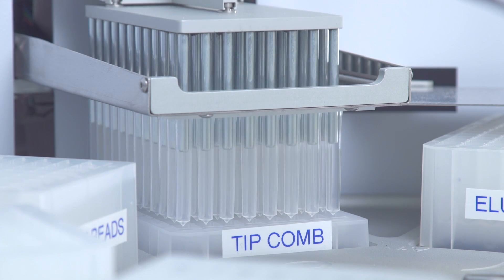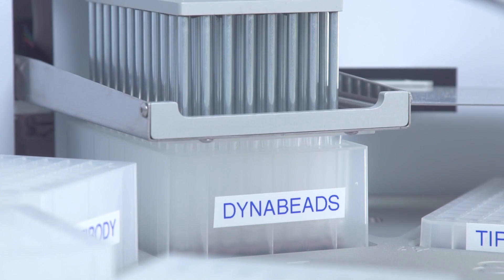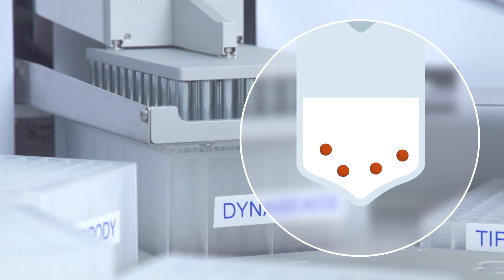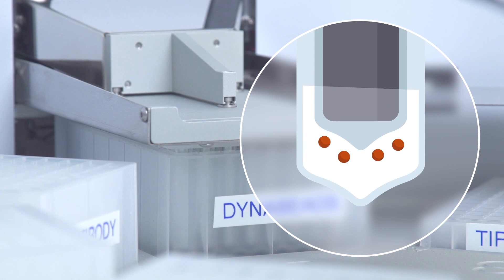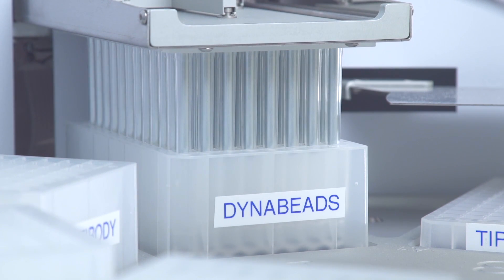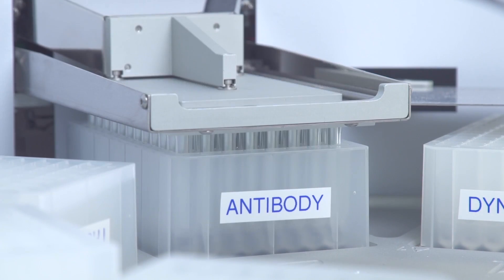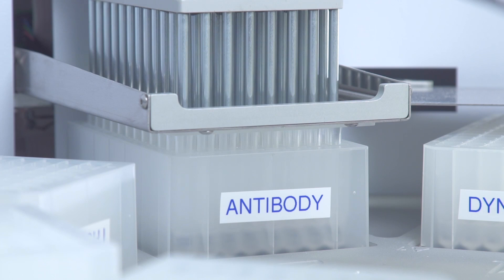The tip combs are used together with the magnetic rods to collect the DynaBeads. Then the beads are moved to the next plate containing the antibody, while the metal shield under the tip combs prevents cross-contamination between wells.